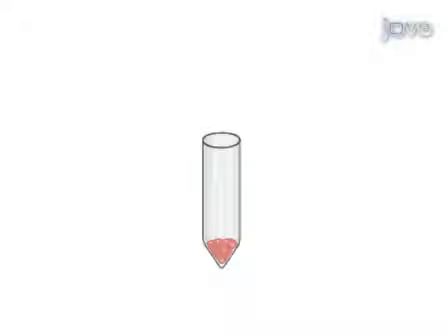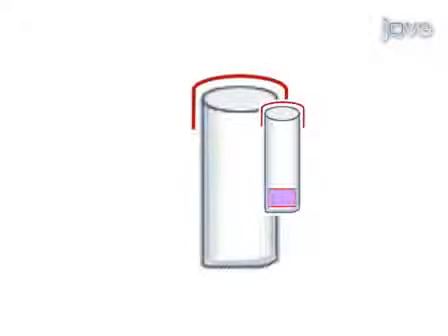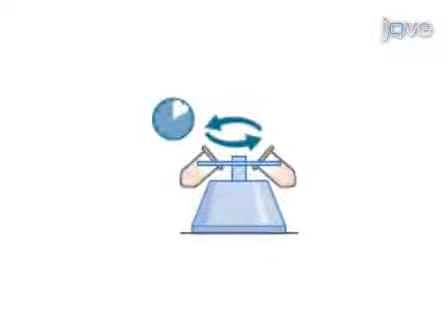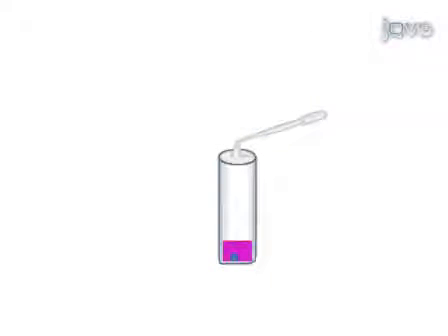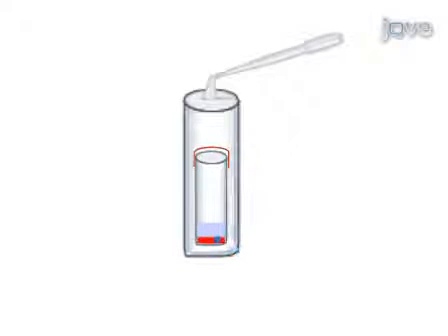Cell block preparation starts with the transfer of the concentrated specimen cells to a flat bottom glass tube held within a larger tube. The cells are then layered at the bottom by centrifugation before adding the AV marker and molten histogel.